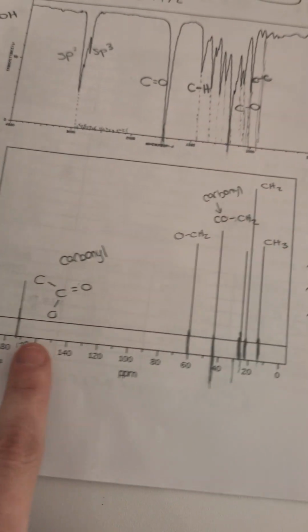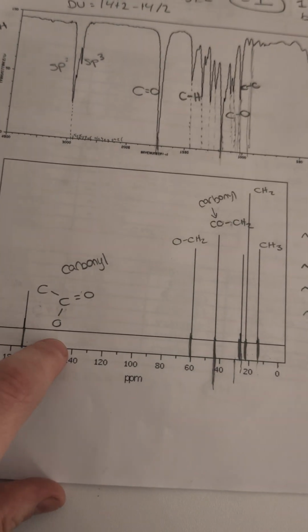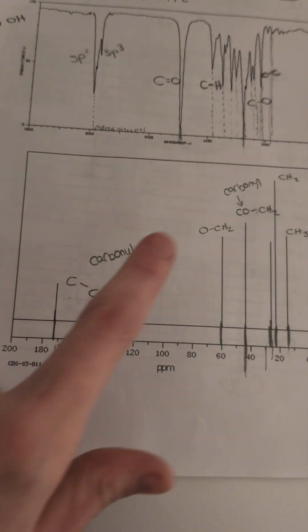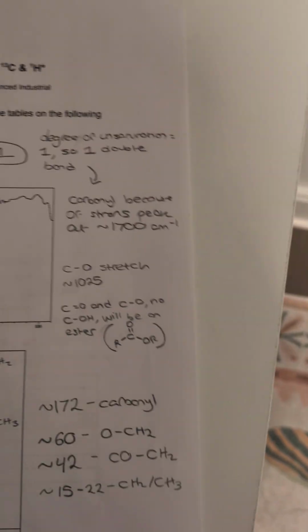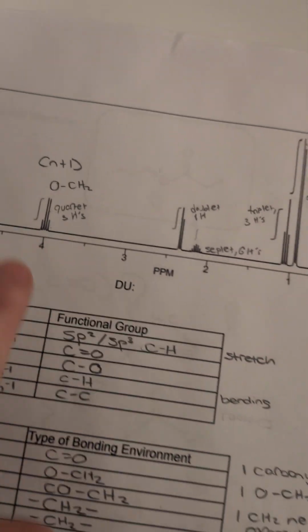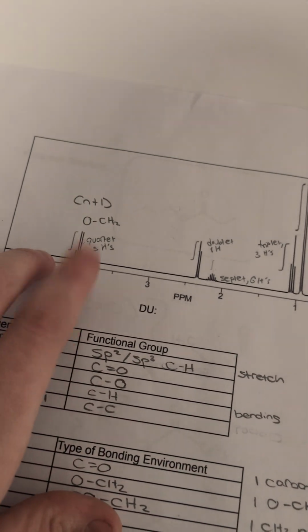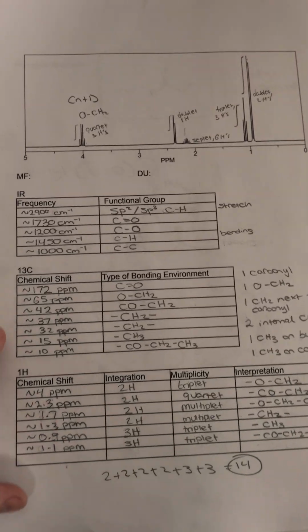This would just mean that a CH2 is attached right here. We have an OCH2, which all supports, this indicates this here, and this indicates this here, my bad. And all this data is recorded better in the data table. I'll show you that. Then we take a look at the HNMR diagram, and we see that we have different data points as well in here, which are better reflected in the data table, so I'm just going to go ahead and show you that.